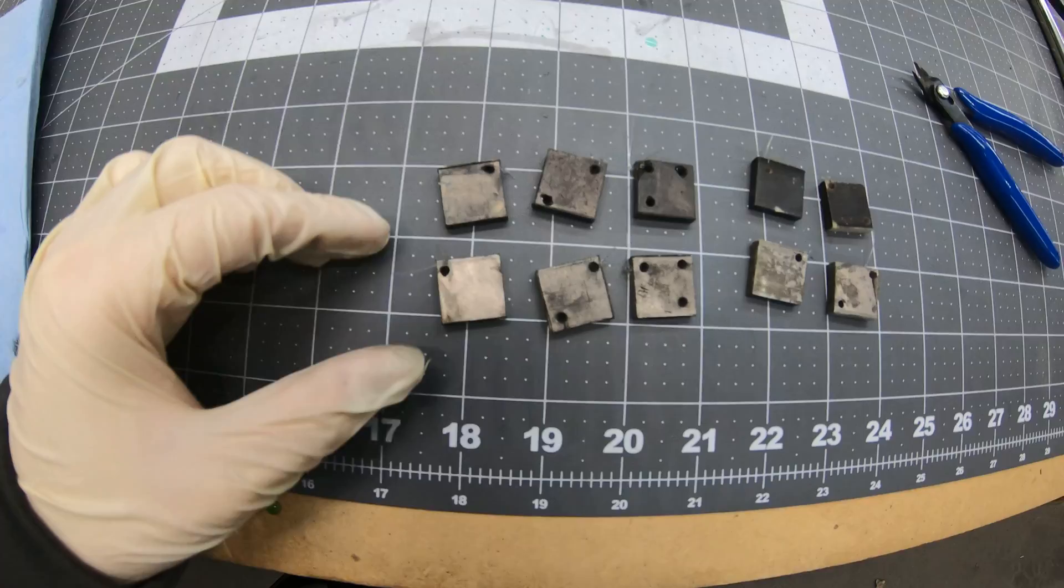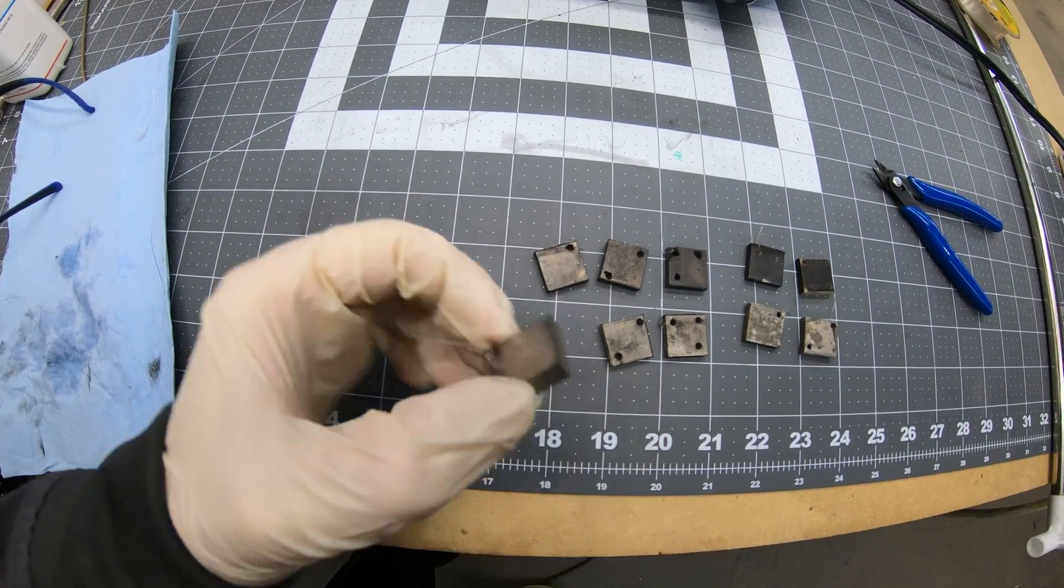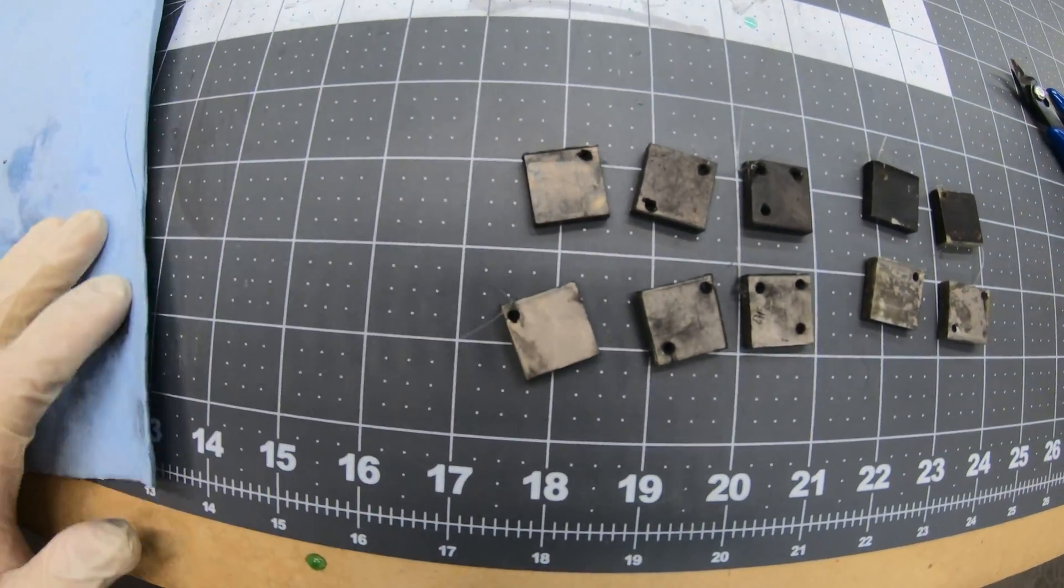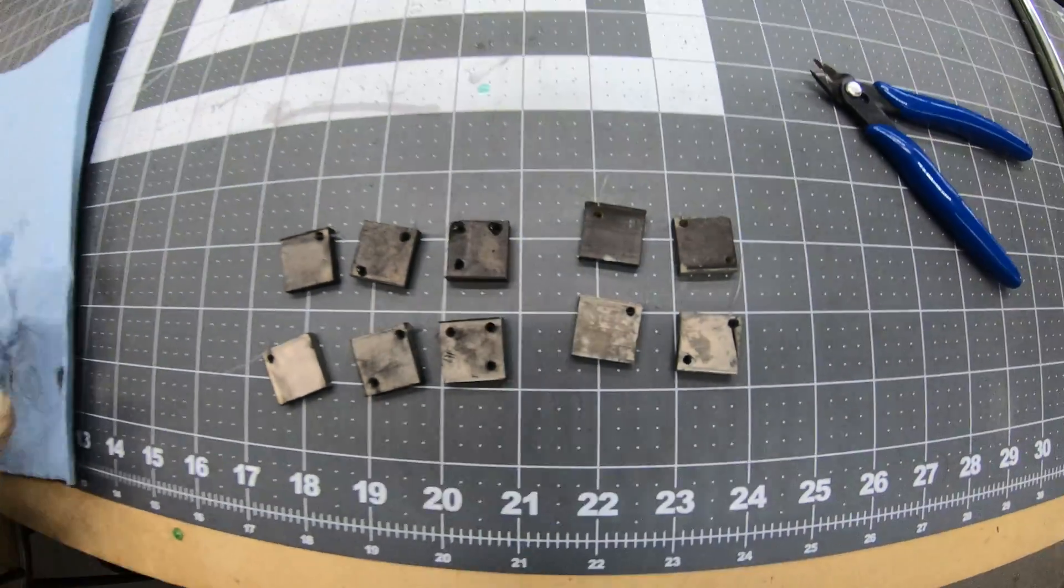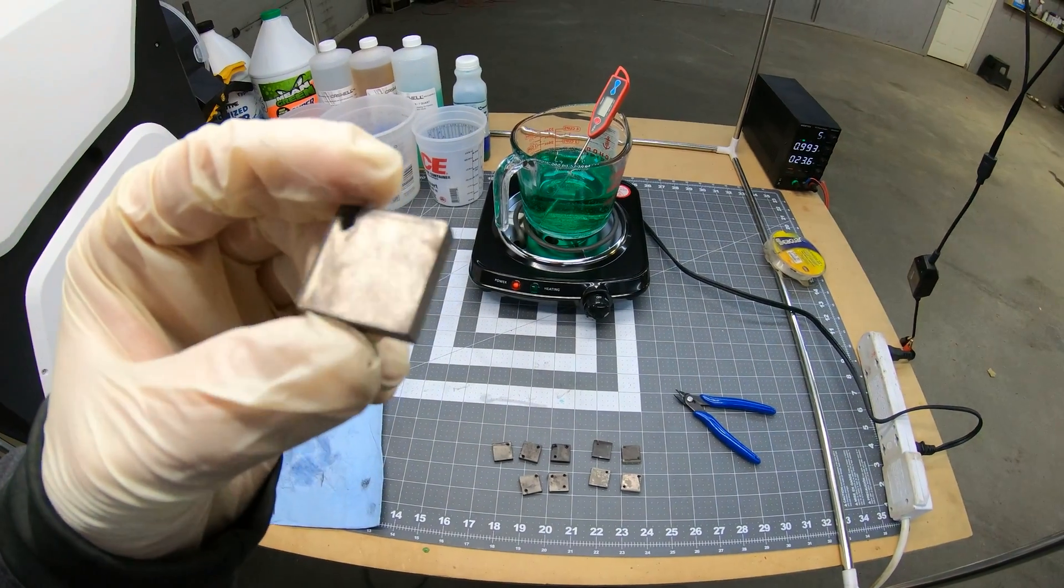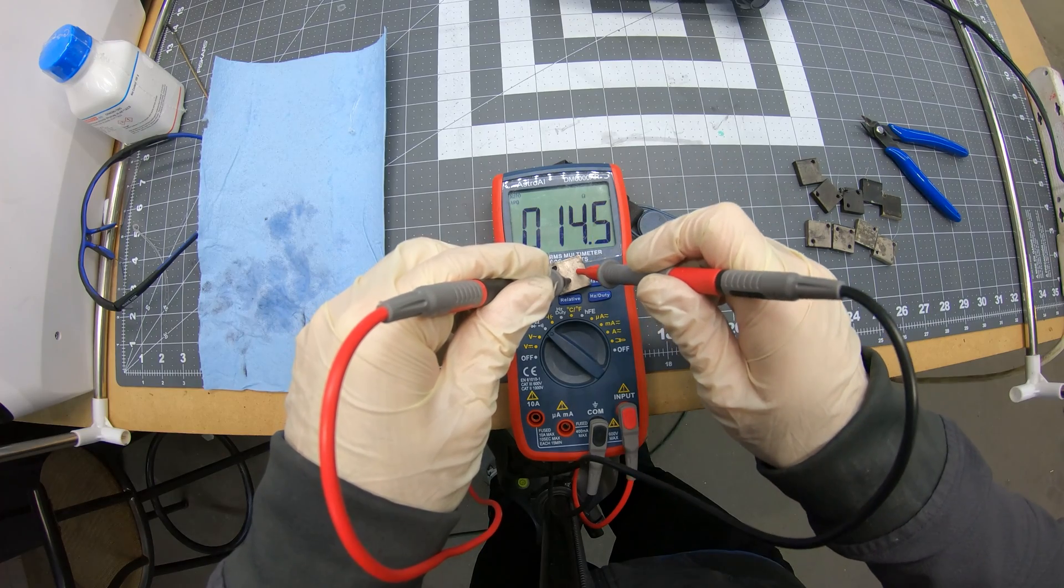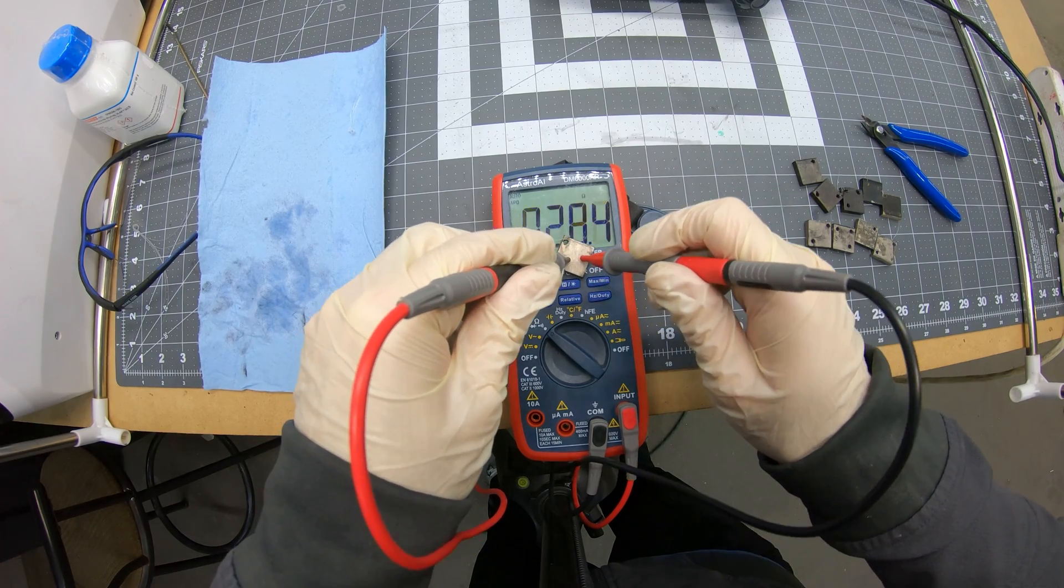The top row was done with the lower temperature. You can see they turned out a lot darker than the bottom row. And the first column is the one that I etched. And yeah, you can really see there's a noticeable difference. The etched version looks super clean. It had the least amount of splotchiness. And also interestingly enough, the new surface was conductive. It looked like it was about a few ohms per millimeter. Hey, that's pretty good.